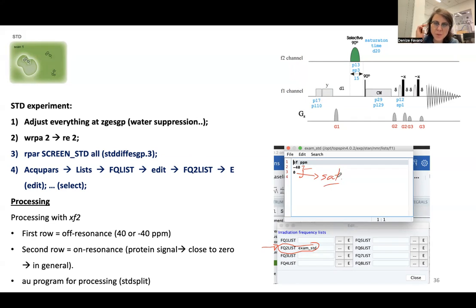I could put something like 0.5 or 0.8, but I have to make sure that there is no peaks from my ligand there. Can I run other saturation points? Yeah, I can check that as well.